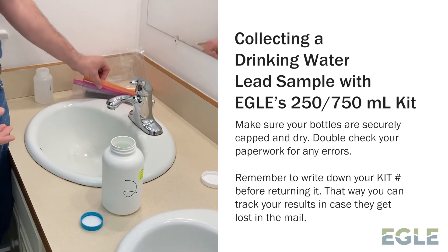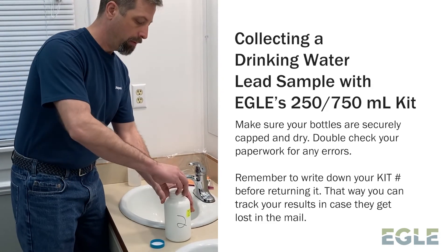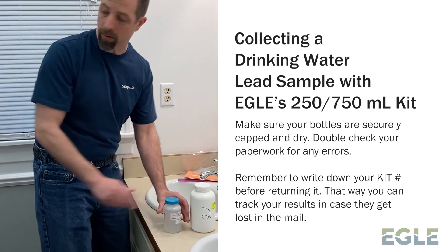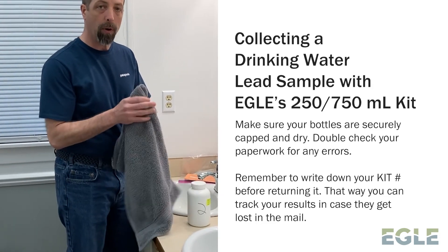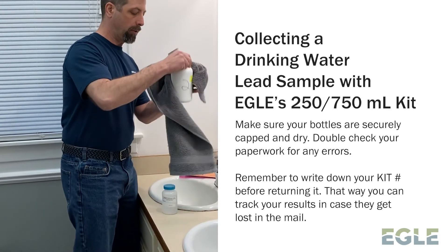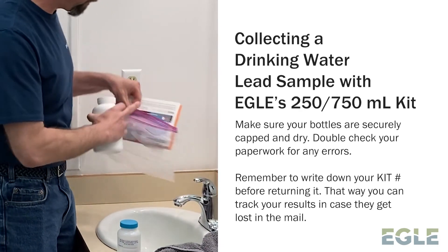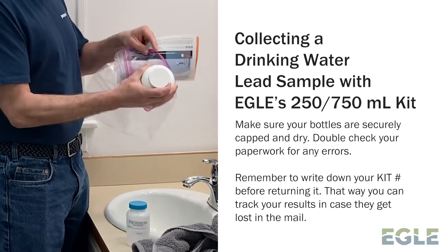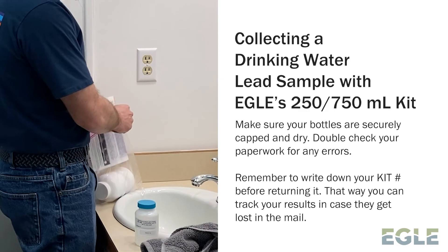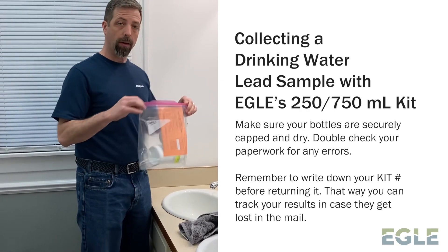Recap your samples. Double-check your paperwork is filled out completely. Put everything back in the bag it came in. You might have to dry off your bottles because you don't want any of your paperwork to get wet, so make sure to dry your bottles well. Once your paperwork is all done and your bottles are dry, put everything back in the bag and then return it to the location that was indicated for you where you picked up your sample, and they'll get it off to the lab to get analyzed.